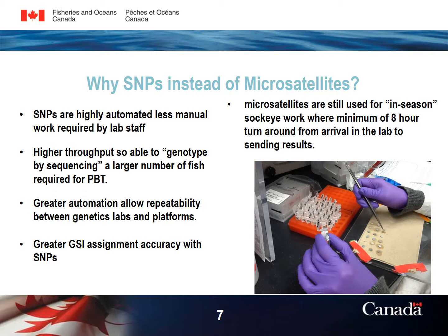But the speed of turnaround is less for microsatellites between when the samples arrive at the lab and results are sent off to managers. So microsatellites are still being used for in-season work, where managers often need results from samples the same day as they arrive in the lab.